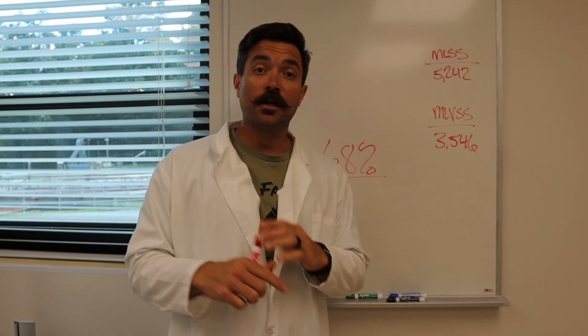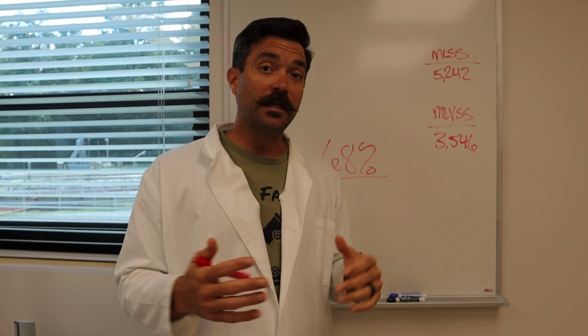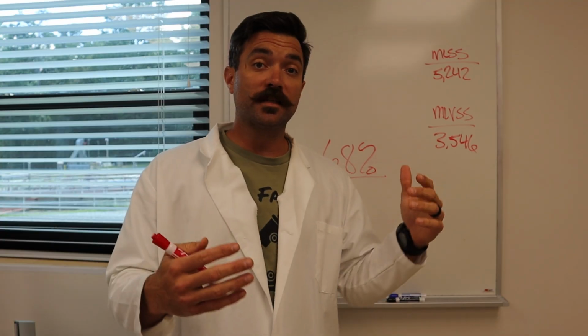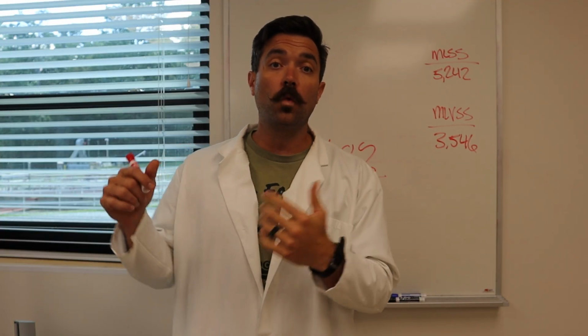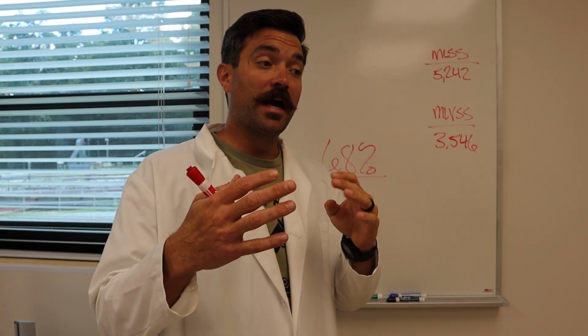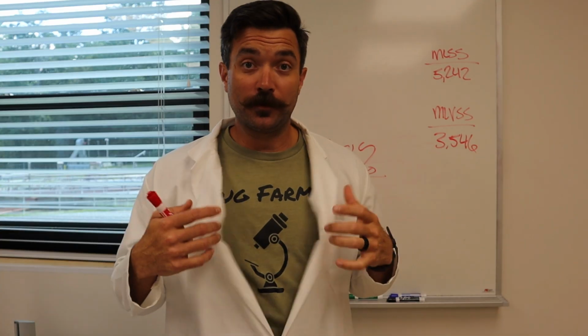But here at this facility, we actually go off of these same numbers every week, sometimes multiple times a week. We run these same tests so that we as operators are well informed of what's going on outside in our process, and that's how we are actually keeping up with our bugs and being good bug farmers, right?